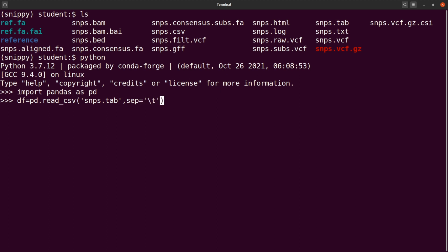And this will tell pandas that this file uses the tab to separate values. But let's revert back to the CSV file. We will stick with that. The default setting is the comma, so we are good to go. So let's run this. Now we have it done.